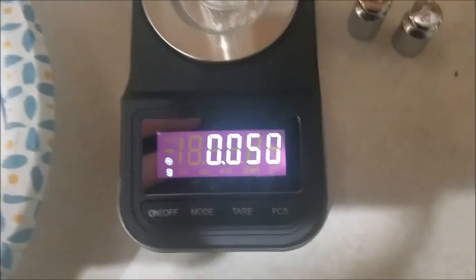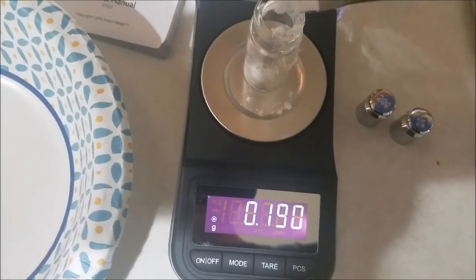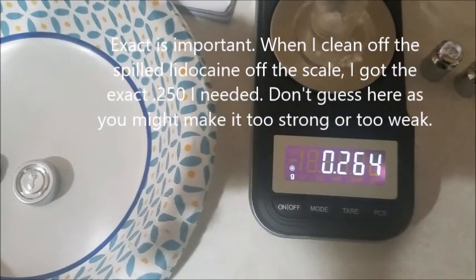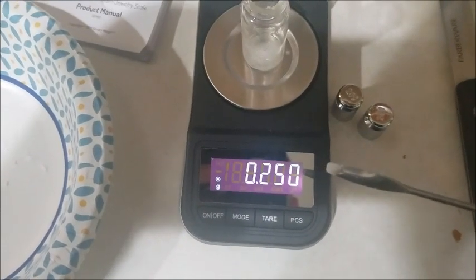Well, that wasn't very good. We're going to have to add a little bit more. We want that to say 250. So we're at 0.1. We're at 190. Alright, and we're at 264. Close enough. Alright, after I cleaned off the spilled lidocaine that was on the scale, we got the scale down to what we need, 0.250, which is 1/4 of 1 gram.